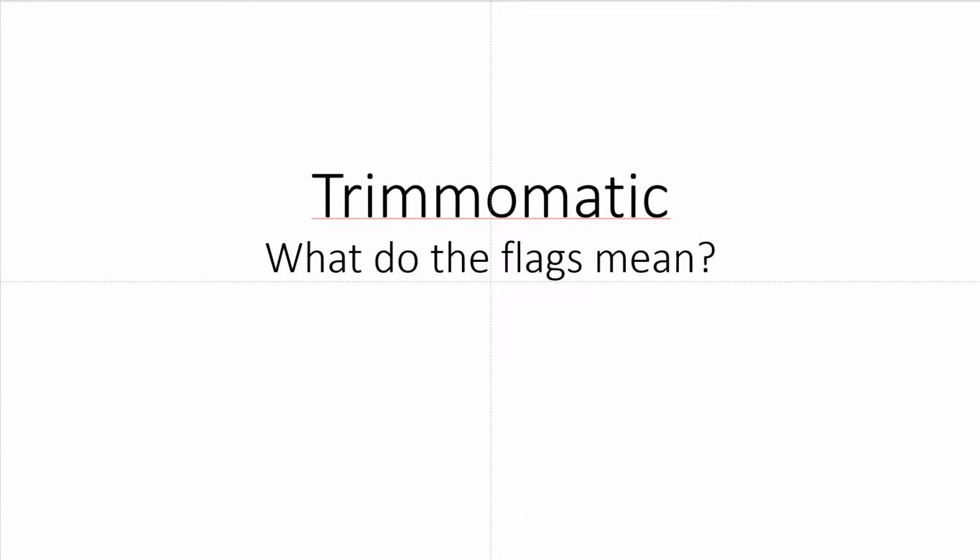Okay, hello everybody. So today I figured we can start talking about the next tool that we were using after FastQC and MultiQC to summarize the FastQC results, and that is Trimmomatic. This is actually something that we've already started running in the video Bioinformatics, SRA, download, QC, and trimming. And today I wanted to talk a little bit about what the flags that we're inputting into Trimmomatic actually mean.